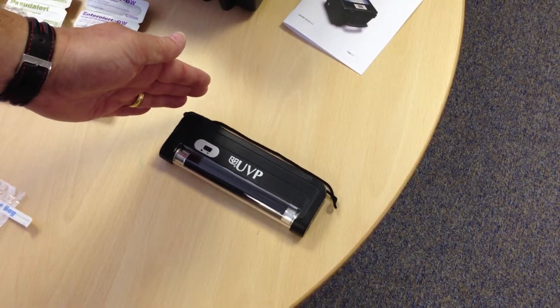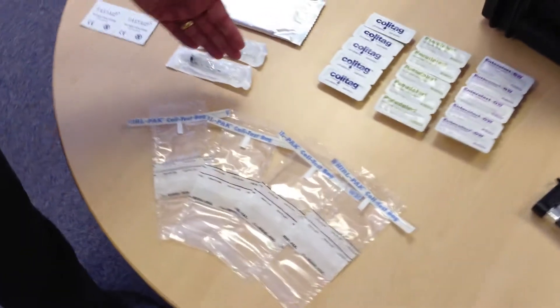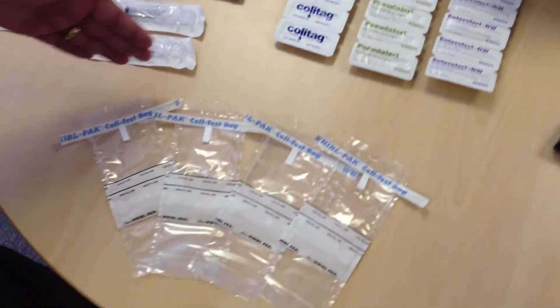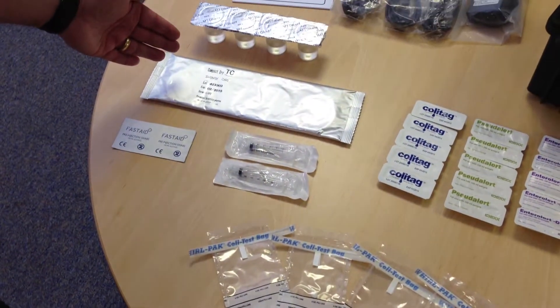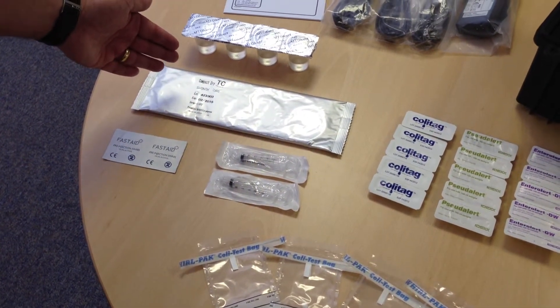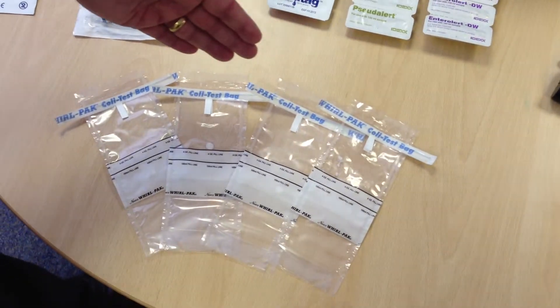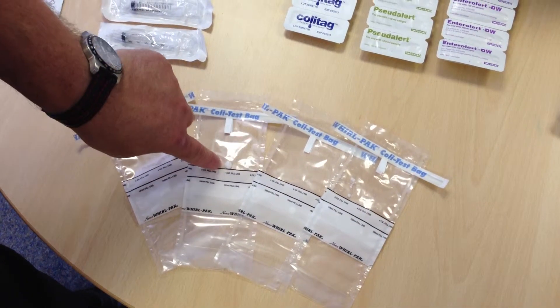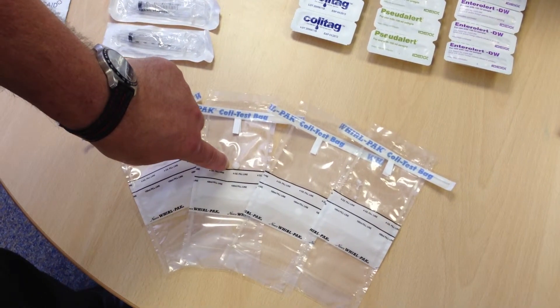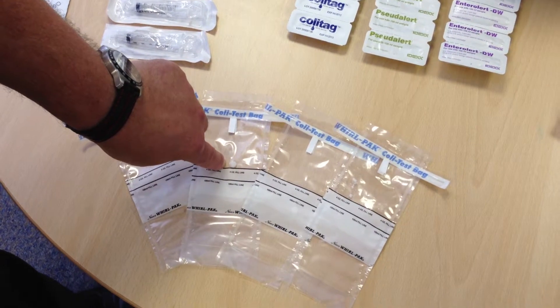Some of the tests will require using the small portable UV lamp. Finally, to obtain your water samples — which will all be 100 ml apart from the TVC test, which is 1 ml — you will use the sterile 100 ml sample bags, which have the addition of a sodium thiosulfate tablet to neutralize the chlorine in the sample.